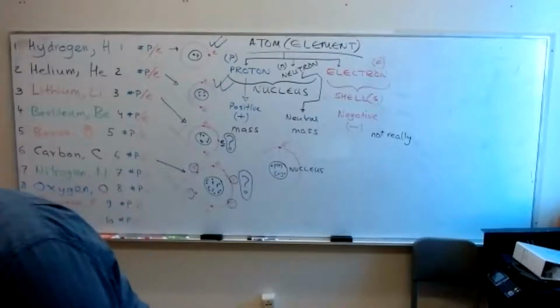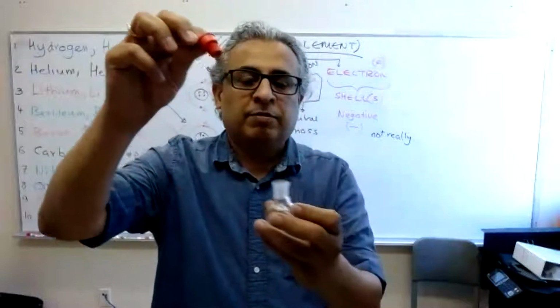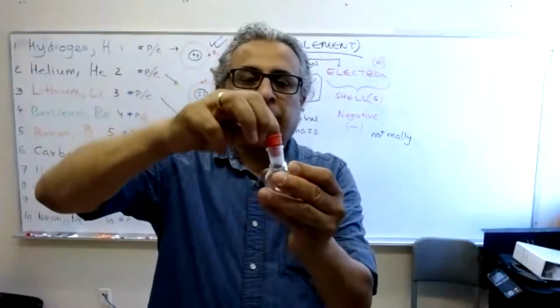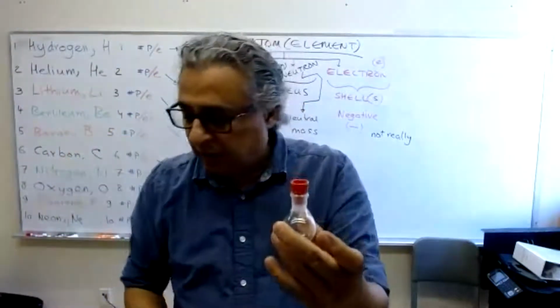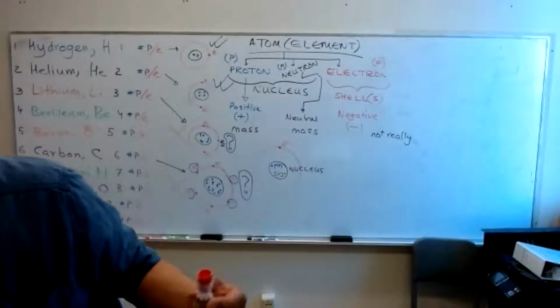These are sometimes used as a little rubber septum for covering it, if you're running a reaction. I have it here somewhere. Where is it? Oh, there you go.